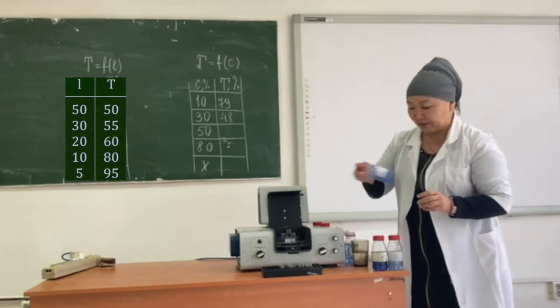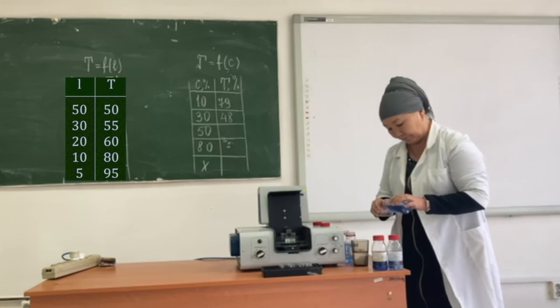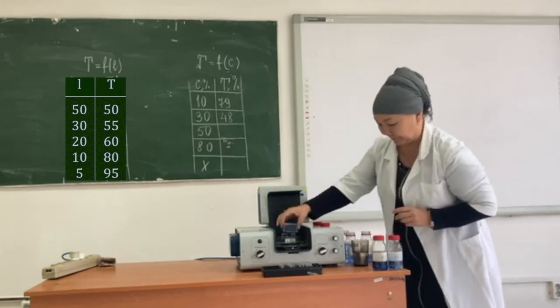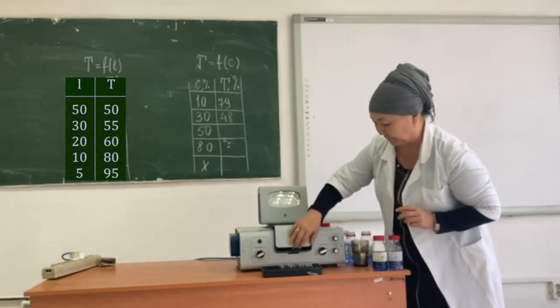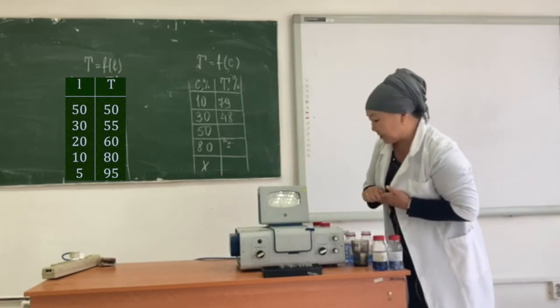Let's take a 50% solution. At this concentration, the transmittance is 28%.